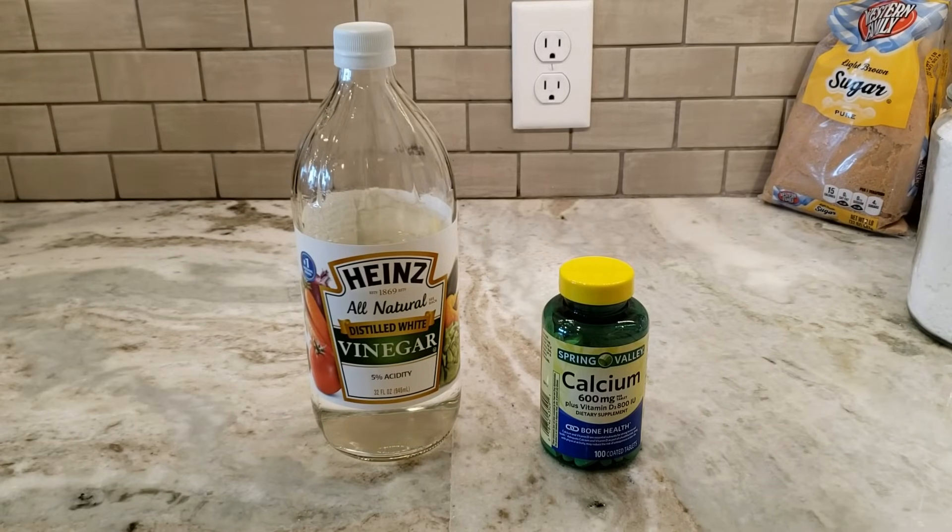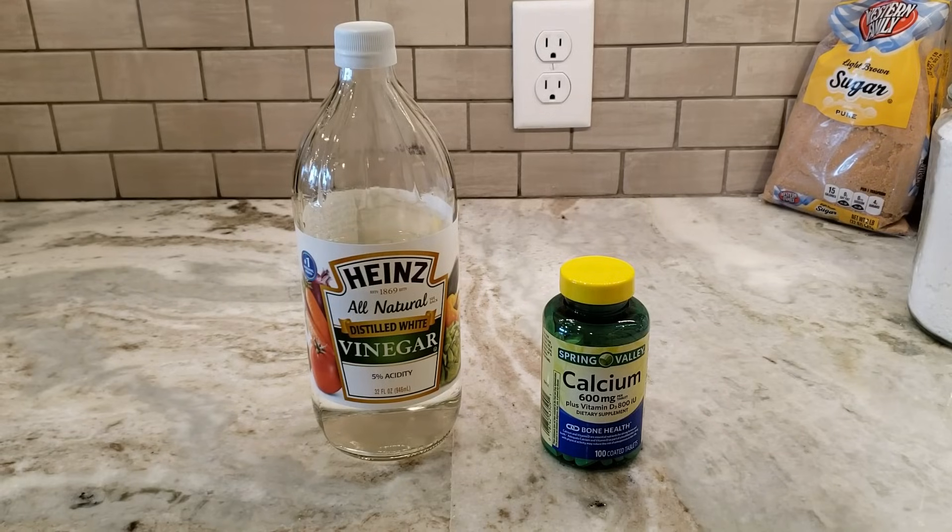Hello everybody, welcome back to another day at the Elemental Workshop. Today we're going to be making some calcium acetate, which we're then going to use to make an alcohol jelly that you can use for camping fuel or just for some fun experiments.